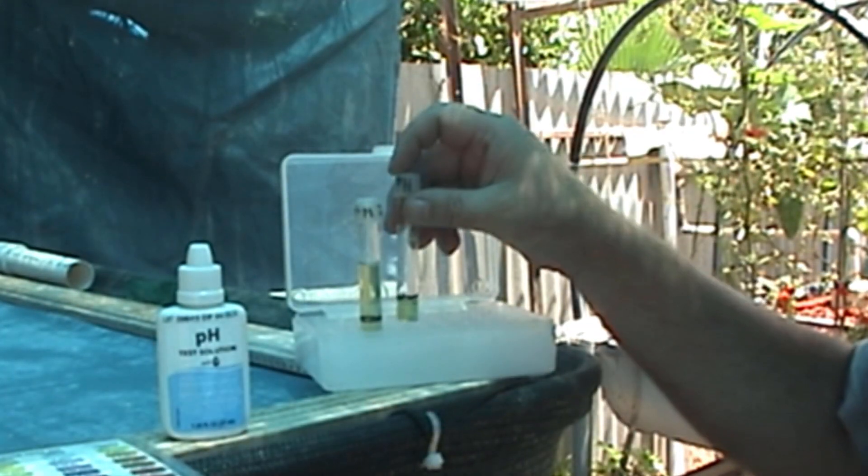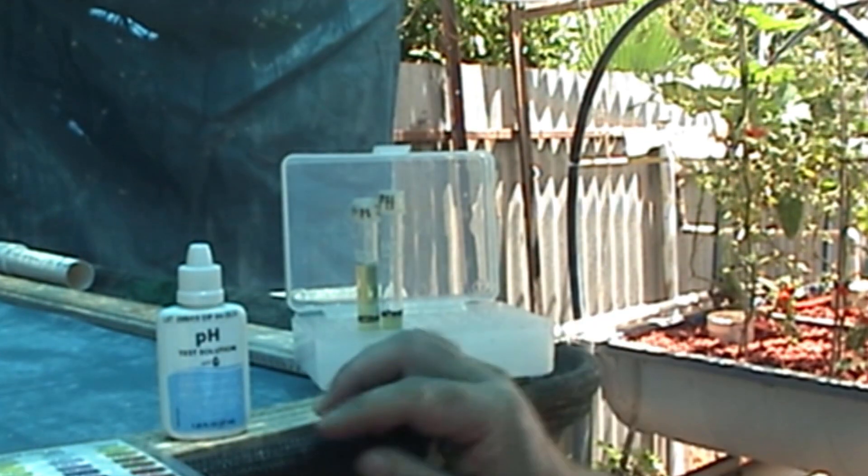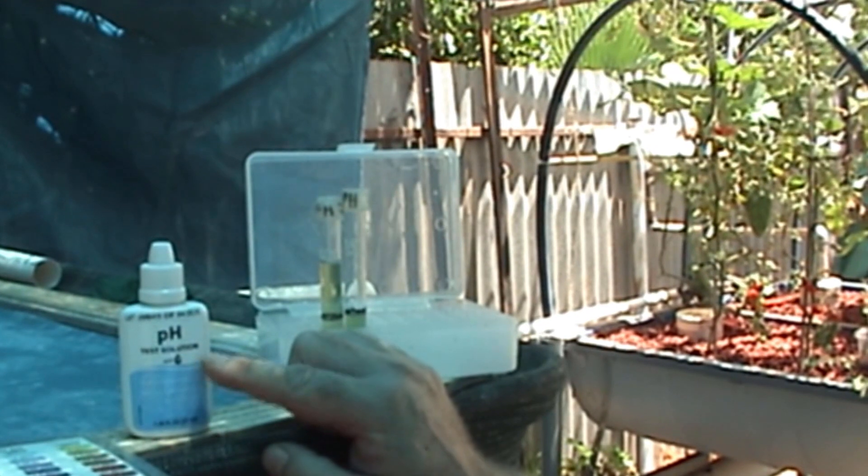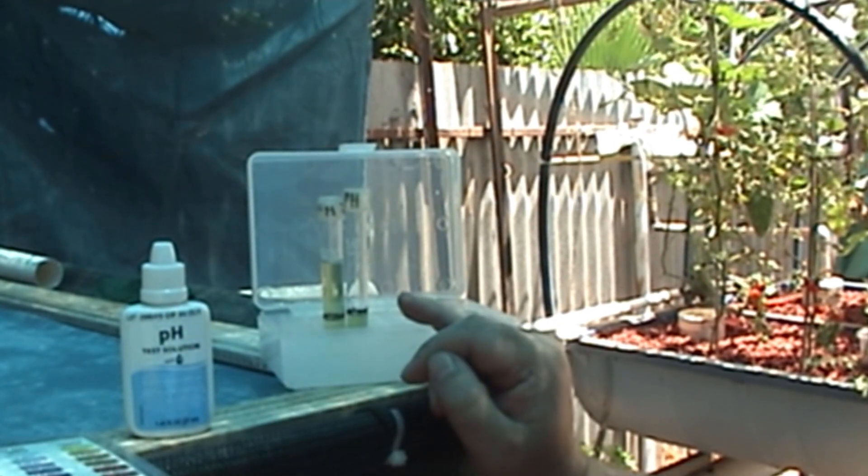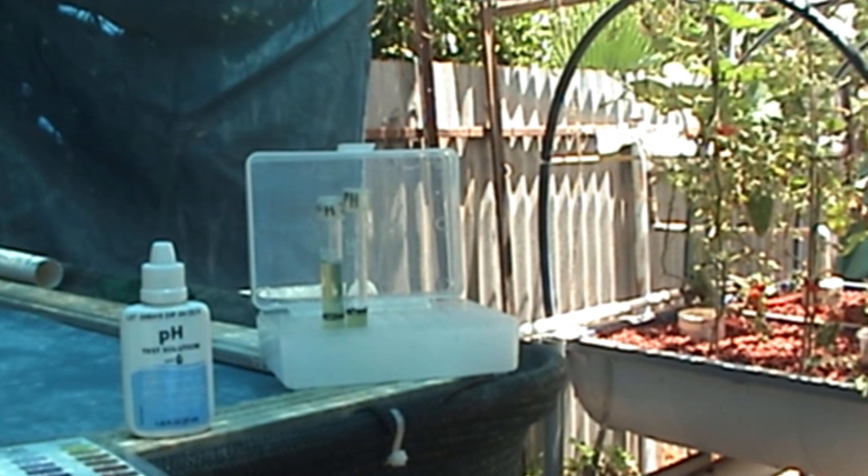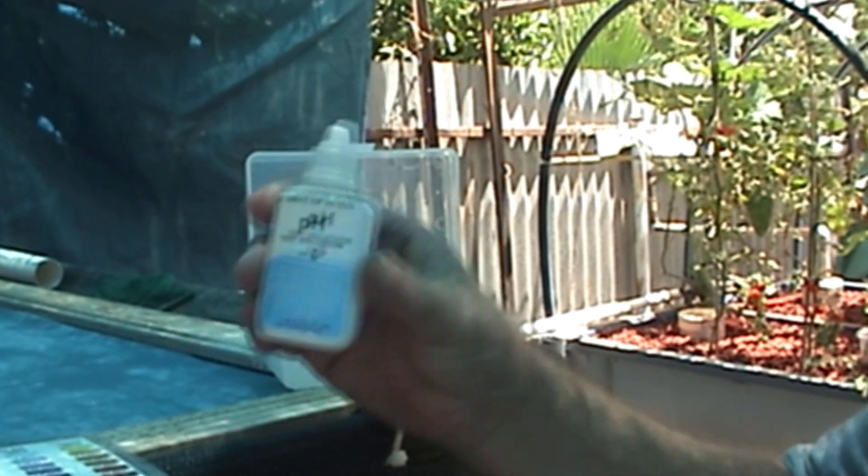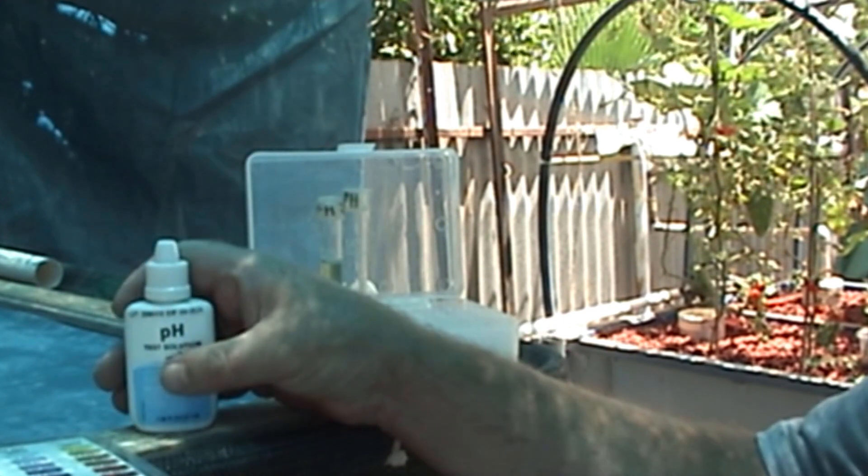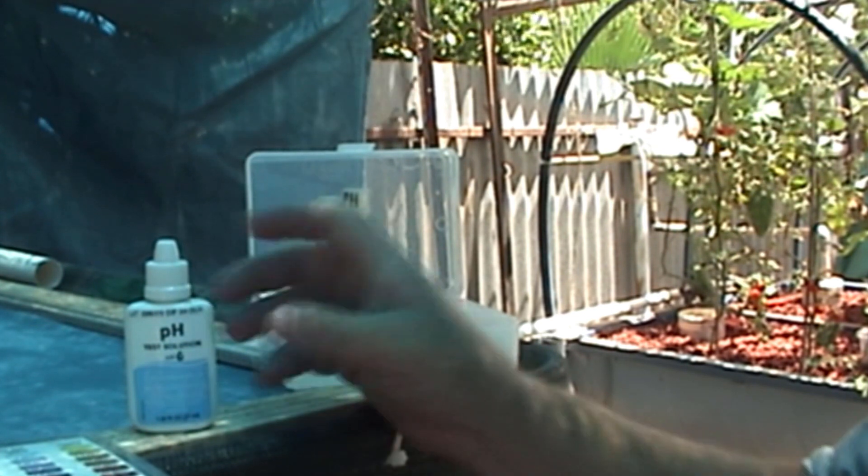That is now reading 6.6. What I've officially done is, instead of putting 3 drops in, I'm putting 1 drop in at 1 and 2 thirds of a mil, which gives me the same test. I'm saving 2 drops out of that 1 test. That's the normal pH. What I'm going to do now is do the high pH.